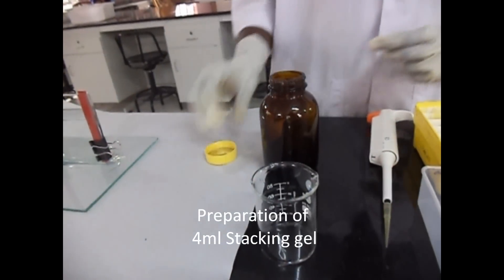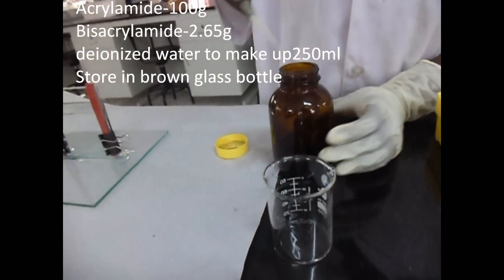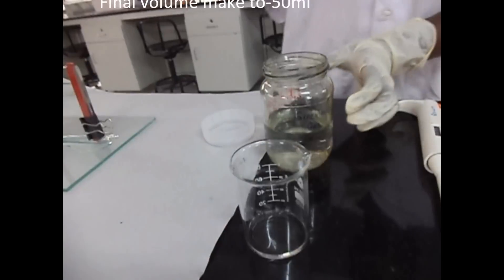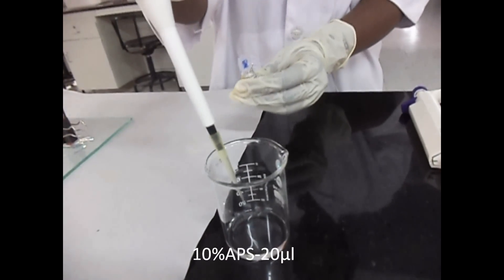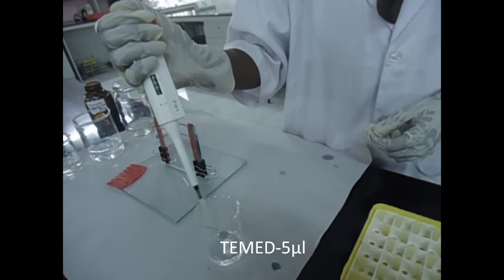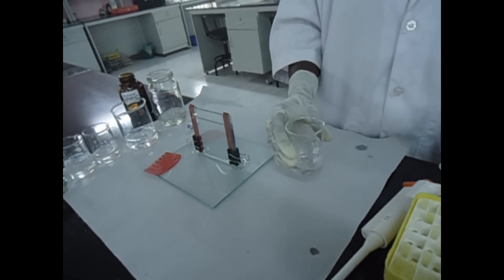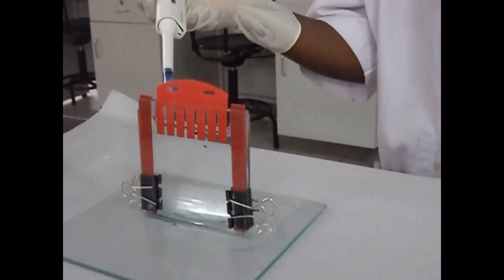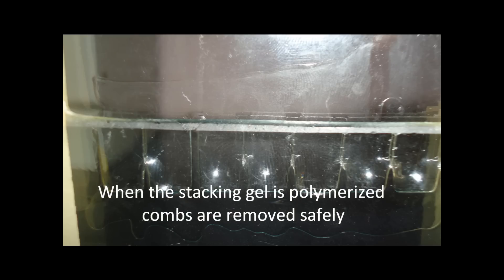Preparation of 4 ml stacking gel. The reagents required are: 40% acrylamide bisacrylamide 0.4 ml, 4x stacking gel buffer 1 ml, distilled water 2.6 ml, 10% APS 20 µL, and TEMED 5 µL. Mix gently and use immediately because polymerization starts when TEMED is added. Insert the comb and fill the remaining gap with stacking gel. Polymerize for 1 hour at room temperature, then remove the comb safely.